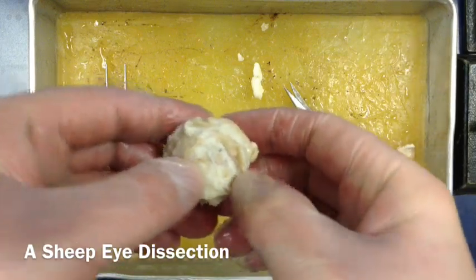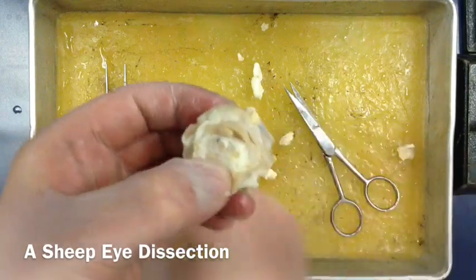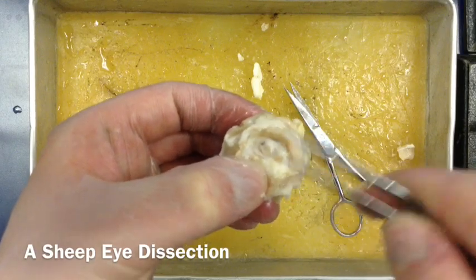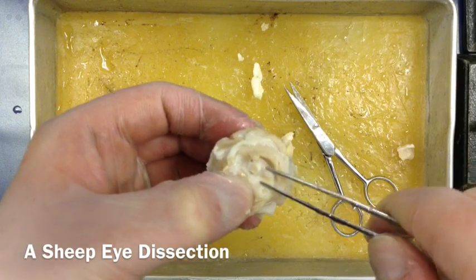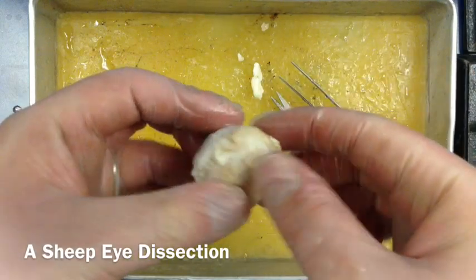We've cut some of the muscle off - we don't need to cut off too much. Right here is actually the optic nerve, which is of course the main nerve coming from the eye. It transmits signals from the eye to the brain. It's full of nervous fibers and bundles.